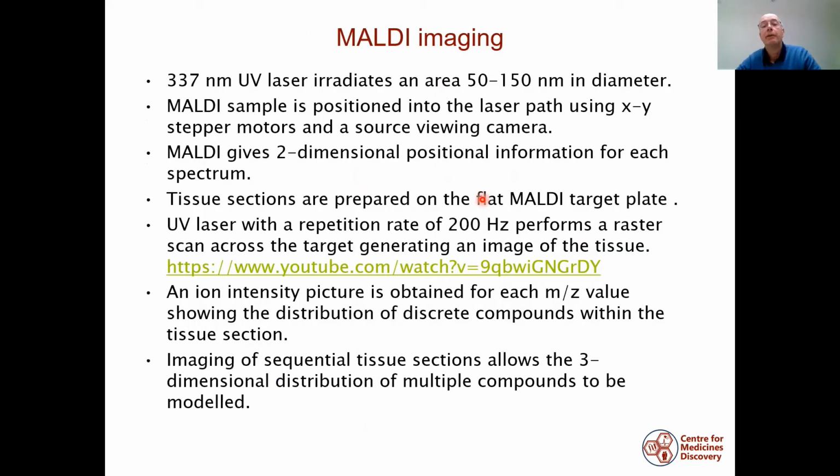I now want to talk about MALDI imaging. This is a technique that's been around for a long time now, probably over 20 years, originally developed by Richard Caprioli and Marcus Stöckli, but it is becoming quite mainstream now. How it works is your standard MALDI laser is a 337 nanometer ultraviolet laser, and it will irradiate an area on the target roughly 50 nanometers in diameter.